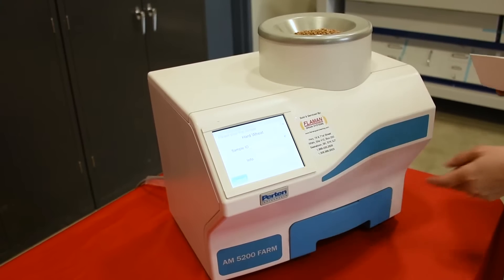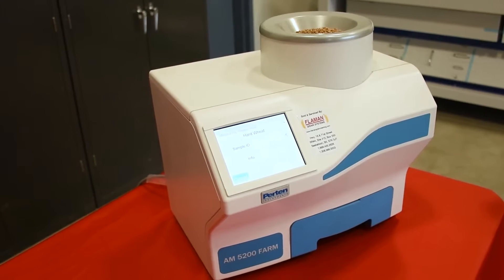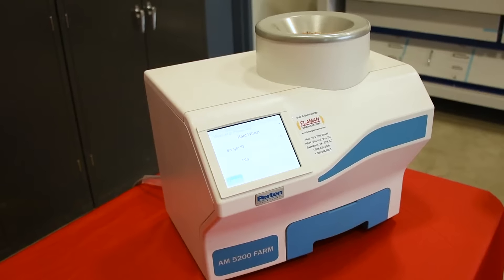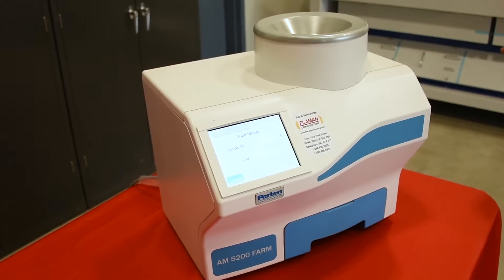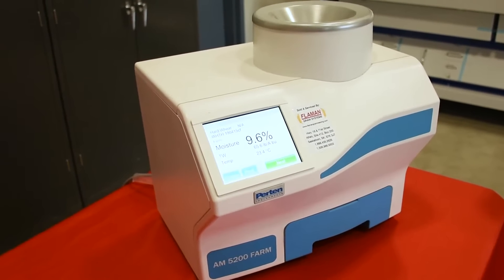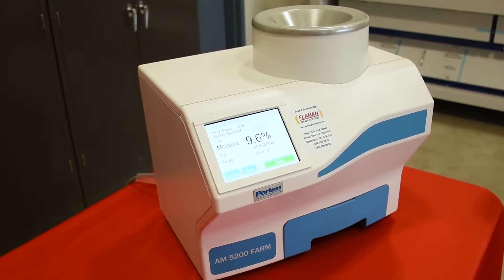There's no need to weigh out the sample; as long as your cup is filled, that's enough sample — it'll just strike off and use what it needs. Just hit go to start analyzing the sample. The meter will display moisture, bushel weight, and temperature.